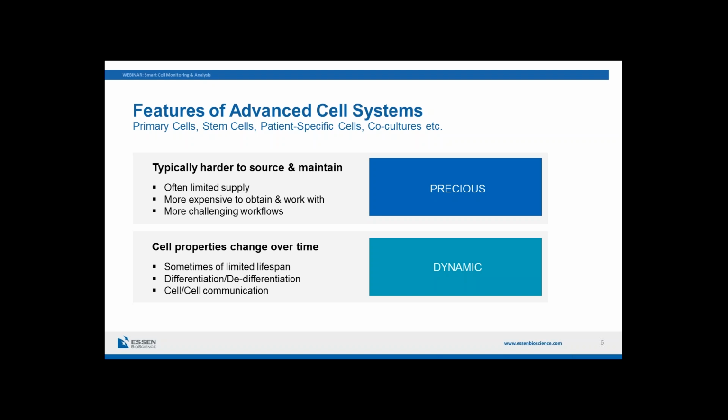I suspect for those of you working with human stem cell derived neurons, for example, you're not throwing away cells as a matter of course because they're expensive and they're precious to you, and you're trying to extract the most information that you can from them.